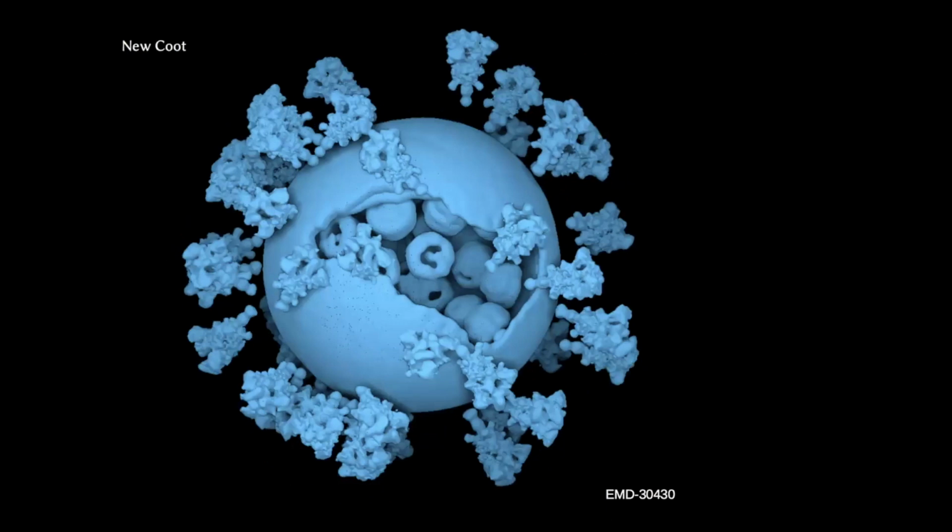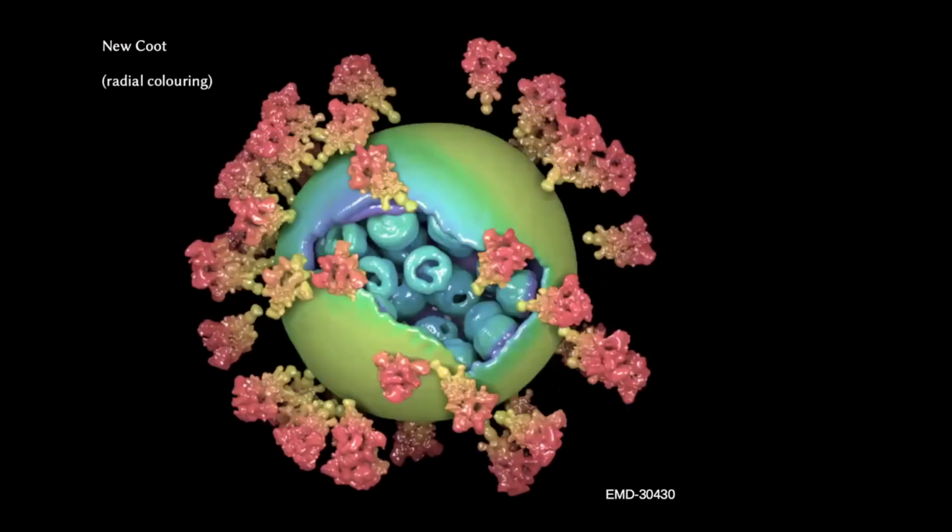in interpretability, I would say. And with a couple of clicks, we can add in additional representation. I can add radial coloring, and instead of chicken wire, I can change it to a transparent surface. And with the clay-like material, I can turn up the shininess to make it a little more like plastic. And we can get a representation that looks like that with a few clicks.